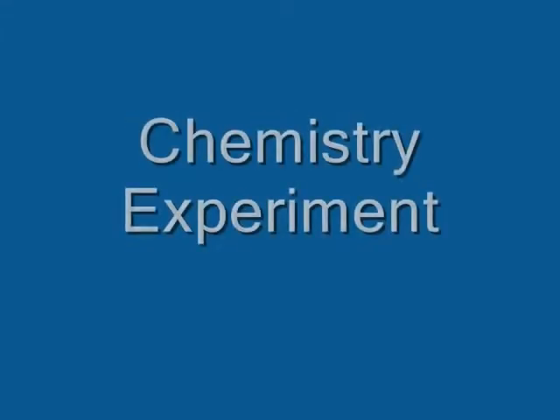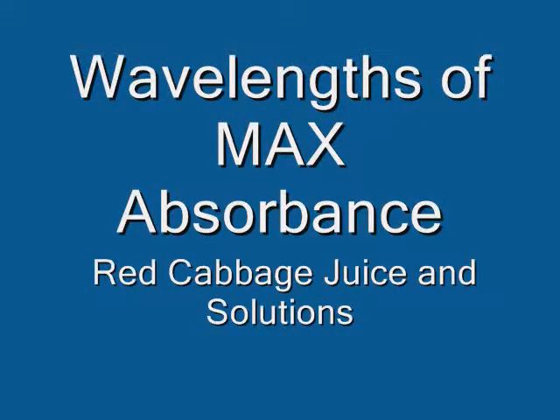The Bryans present: chemistry experiment of wavelengths of max absorbance of red cabbage juice and solutions.